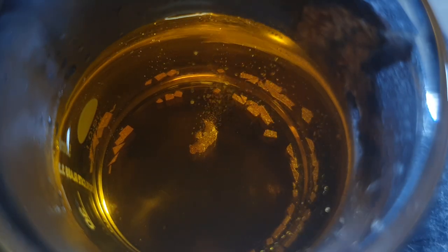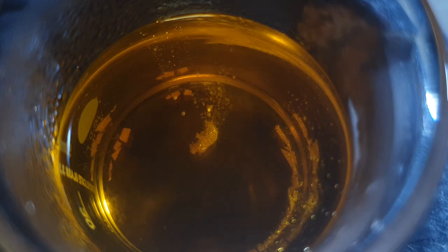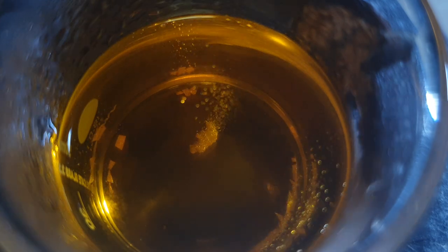I also threw in the small piece of gold that I got by melting the gold powder that was produced by reacting the cesium auride with water. This is a time-lapse of the gold dissolving. You can see the solution changing color as more and more gold gets into solution.